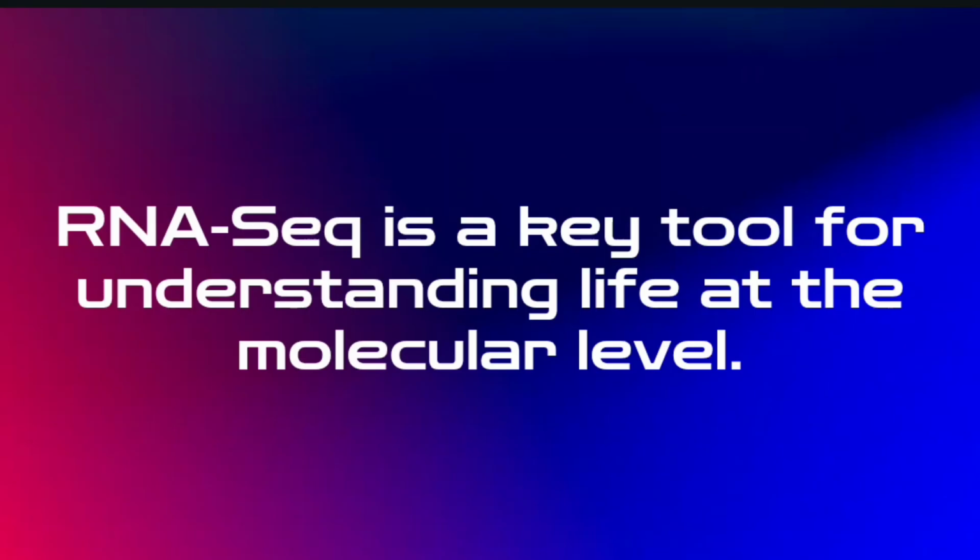RNA sequencing has revolutionized molecular biology by providing deep insights into how genes are turned on and off in health and diseases. From cancer research to neuroscience, RNA-seq is a key tool for understanding life at the molecular level.